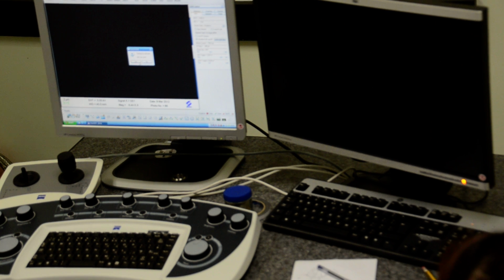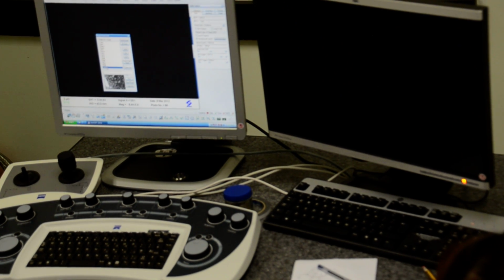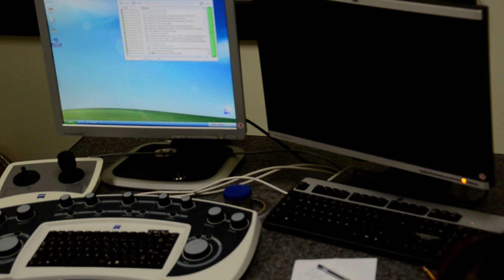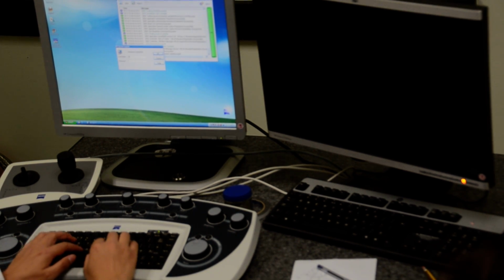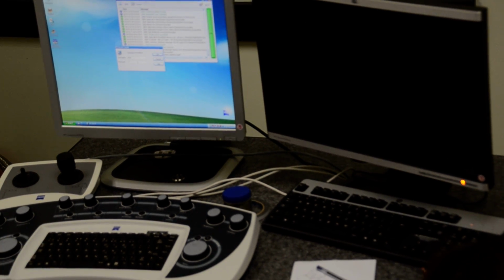Because why I'm saying that, you go to the stage, you already have all the lists. That's actually not saved by you, it's saved by someone else. So if I exit now, logging in again, yeah, okay.